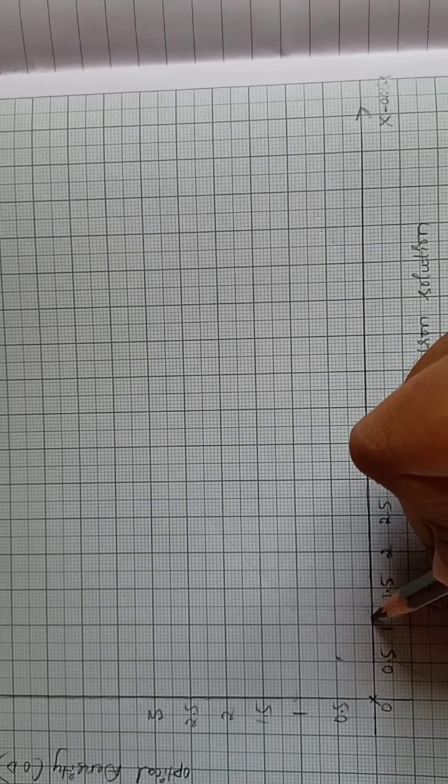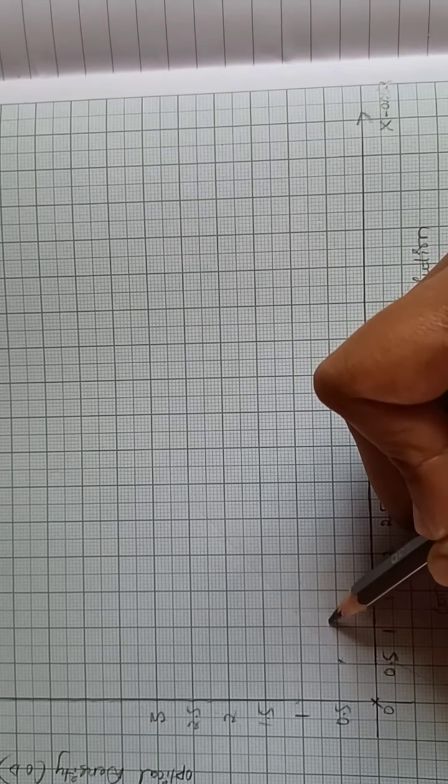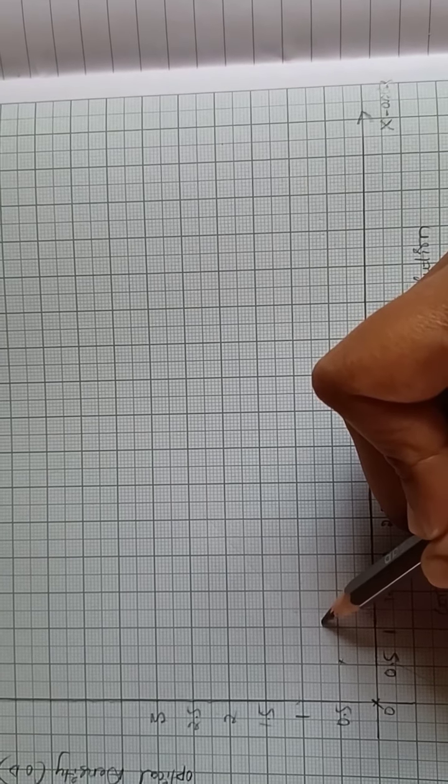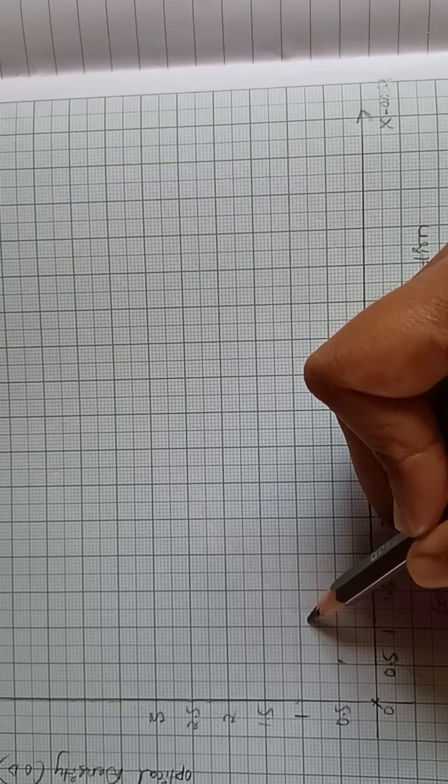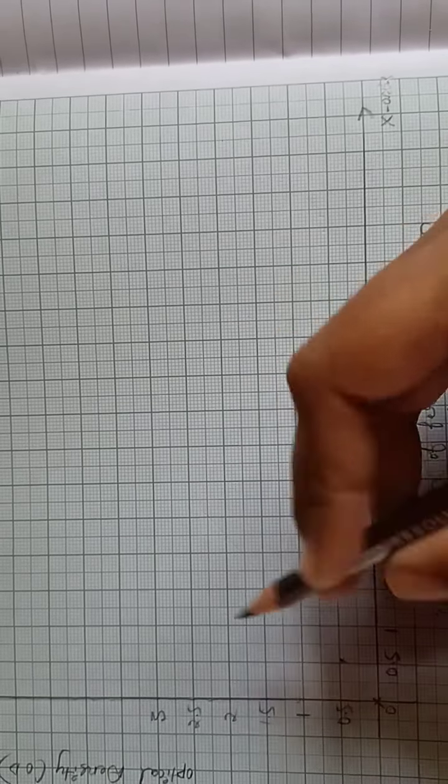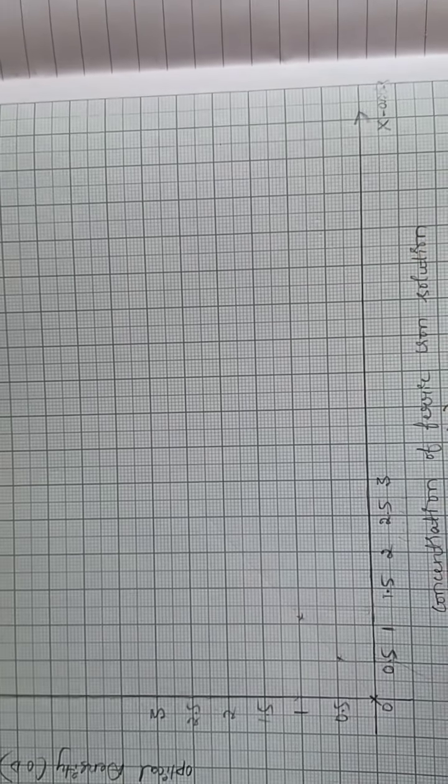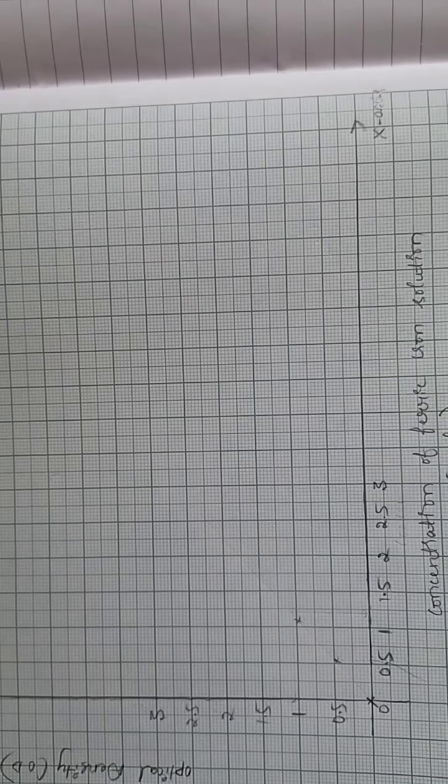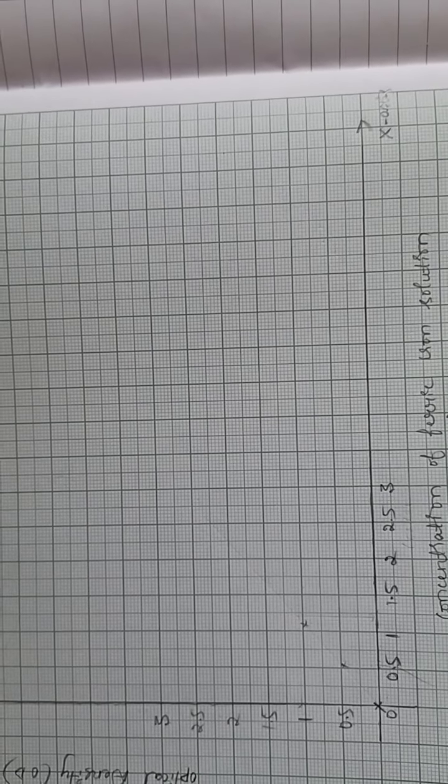And next, 0.6, 0.7, 0.8, 0.9, and next 0.96. And the next reading is 1.65 and 1.39.